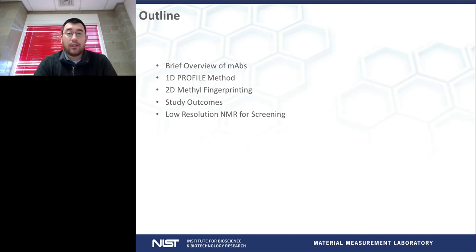So to give a very brief outline of what I'm going to be covering in the next 20 to 30 minutes, I'm going to discuss a little bit about monoclonal antibodies and more importantly, why we care about being able to analyze their higher order structure and why we care about the chemometric aspect of that. I'm going to dive a little bit into a couple of different methods that have been published and some of the studies we've been performing along with those methods to show the robustness and usefulness of the techniques. And then I'm going to present a little bit on the utilization of lower field, lower resolution NMR spectroscopy as a modality for screening protein therapeutics.